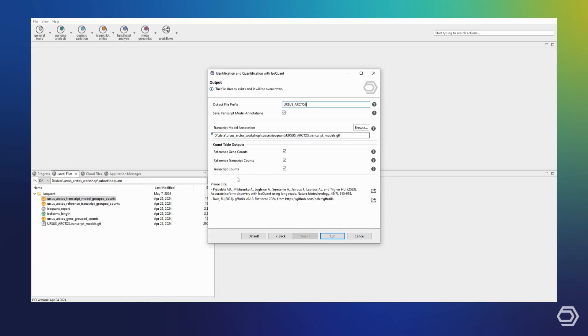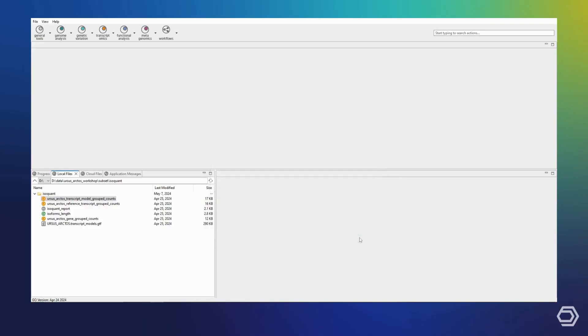Now, we are ready to run IsoQuant, but since I have already done so previously, I can skip ahead to my results.